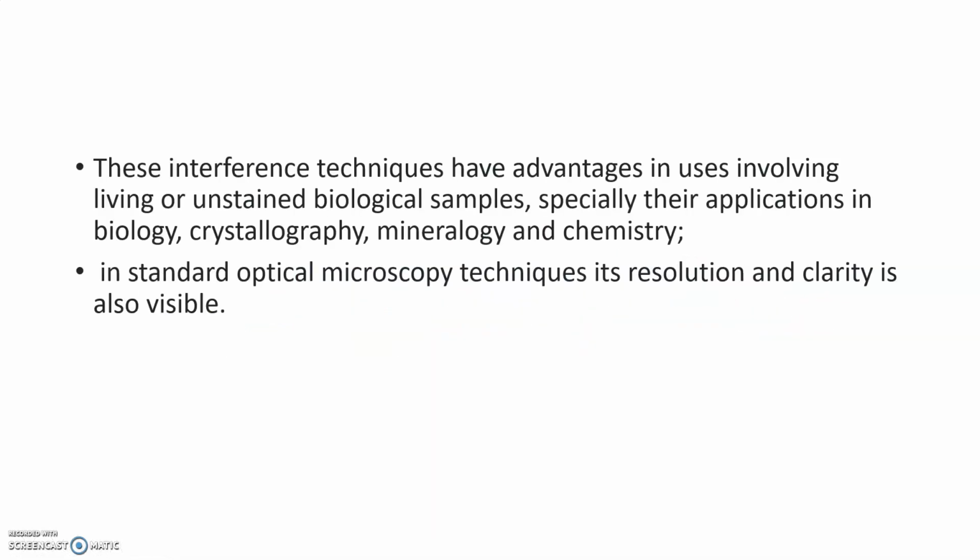These interference techniques have advantages. What are the advantages? Living or unstained biological samples can be easily observed, and they have applications in biology, crystallography, mineralogy and chemistry. So in these fields also this microscope has more advantages.